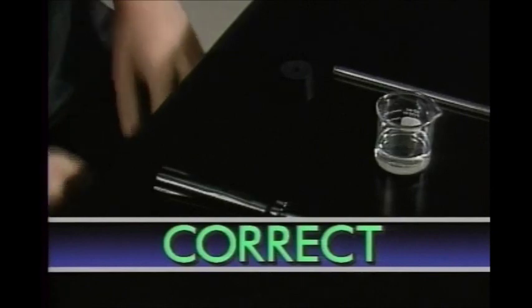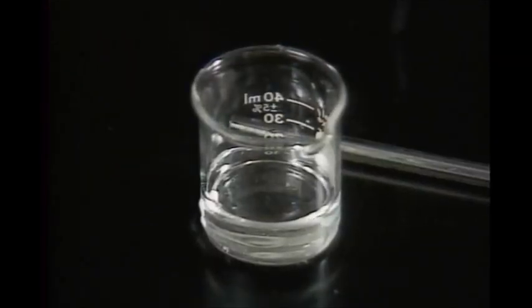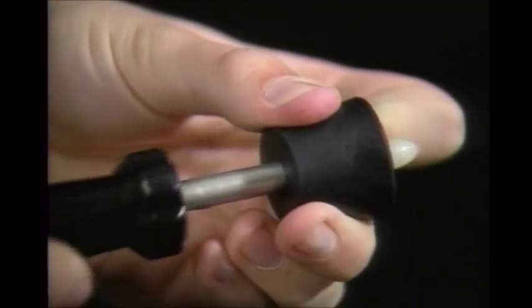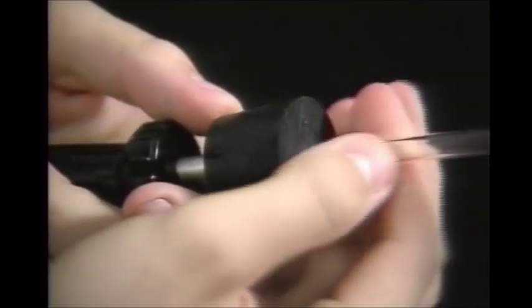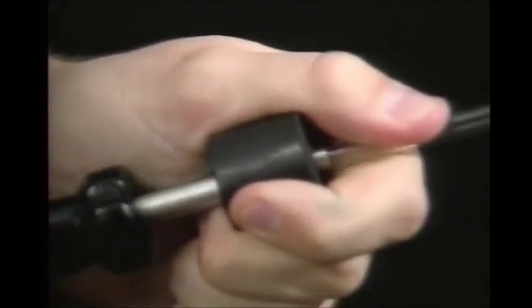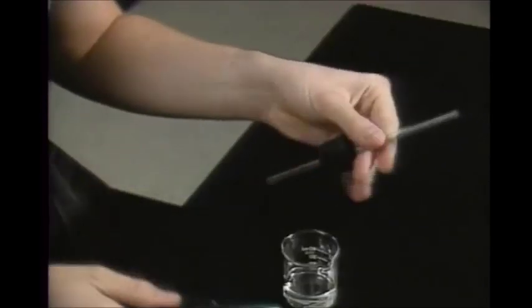First, dip the teflon tip in a glass lubricant such as glycerin, then push it through the stopper. Remove the tip and slide the tubing through the hollow inserter shaft. Removing the shaft leaves the tubing behind.